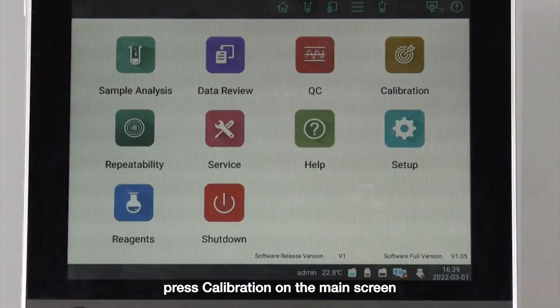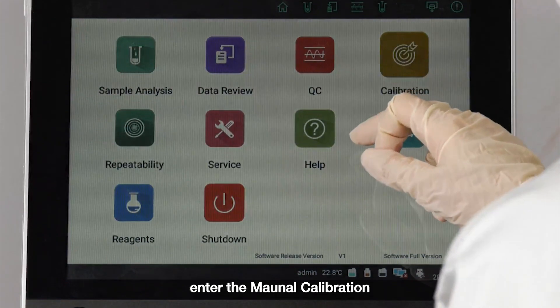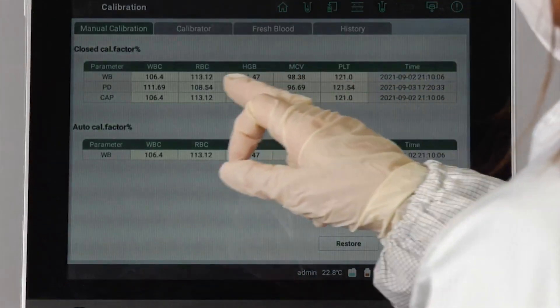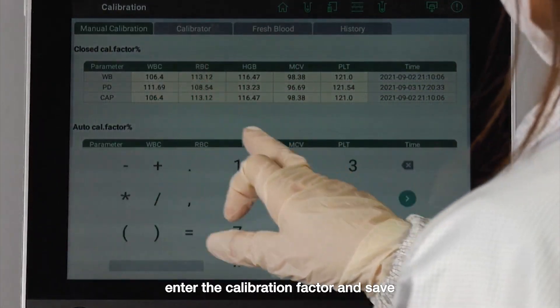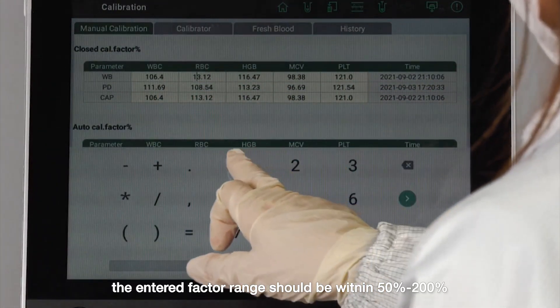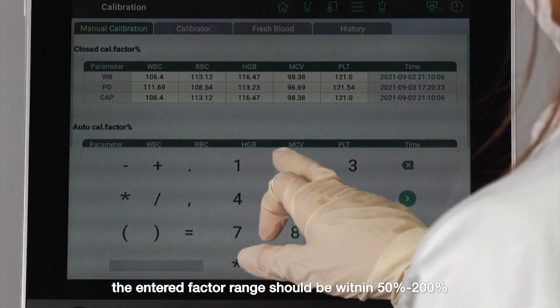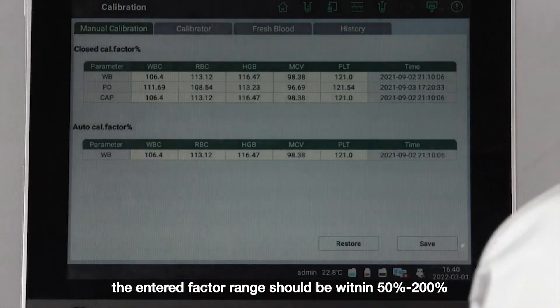Press calibration on the main screen and enter the manual calibration. Enter the calibration factor and save. The entered factor range should be within 50% to 200%.